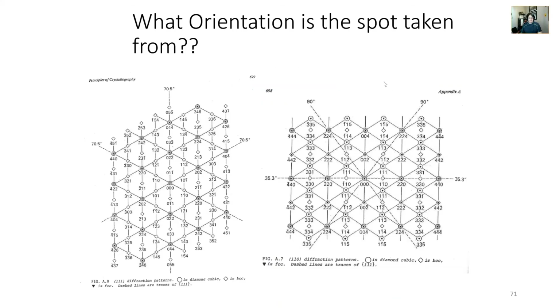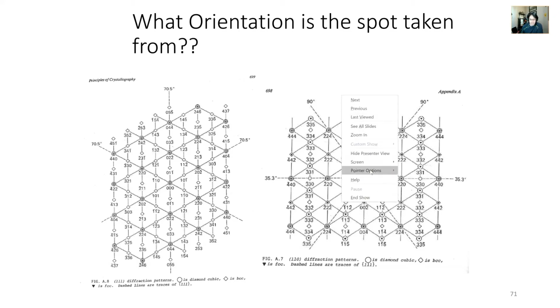I've taken a little pause here because I noticed that this is incorrect. The zone axis is a direction, and they're using parentheses in this book, and I won't say where I got this one from because this person swore to me they never made a mistake. But let me use my laser pointer. This should actually be direction notation, and it's clearly plane notation. And I was so taken aback, I went and looked up Miller indices again, just to make sure I wasn't lying.